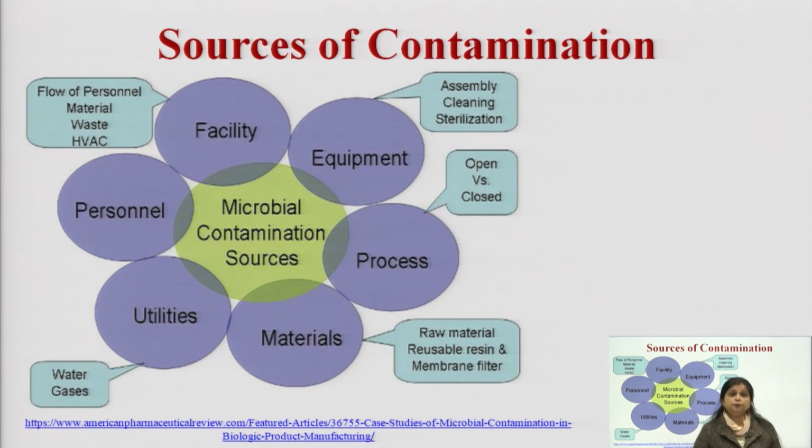So, we have to take precautions while working in those areas. We have to take care what raw materials we are going to use. Those raw materials must be sterile. Whatever raw materials we are going to use, we have to sterilize them. Whatever equipment we are going to use, we have to sterilize it, because it is also a source of contamination. Whatever glassware we are going to use must be sterilized by some technique. The technique may be a hot air oven, dry air, or autoclaving, but we have to take preventive measures.